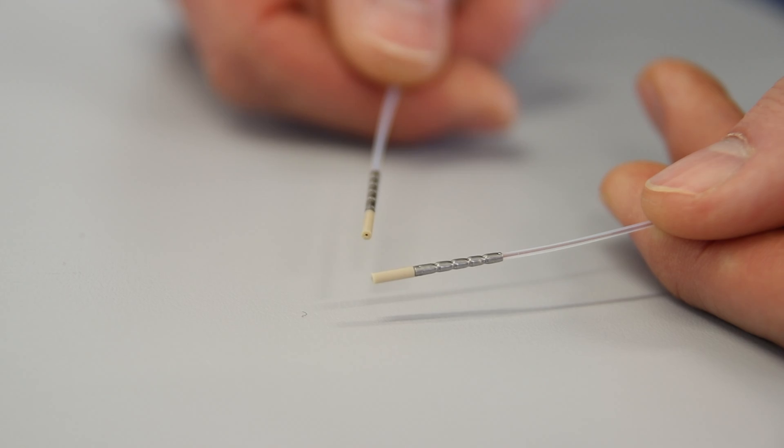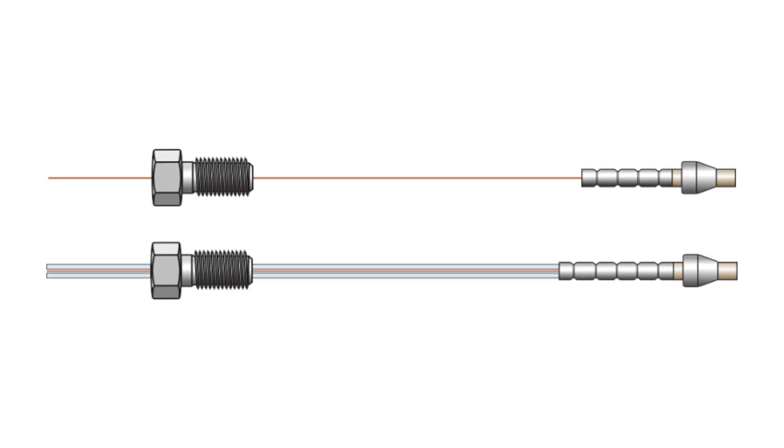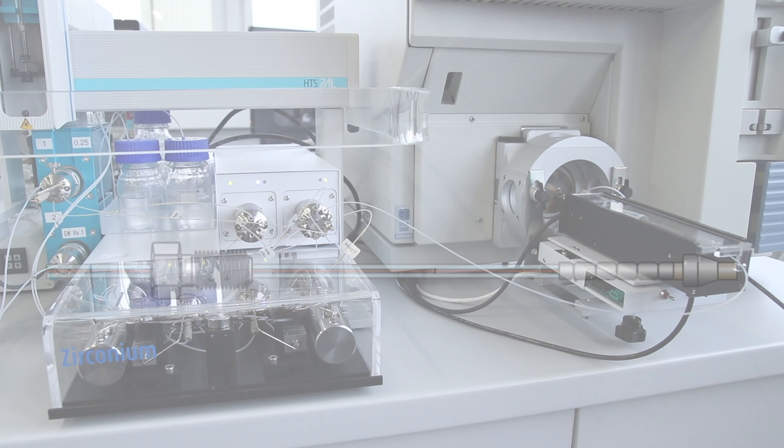In this video, we will demonstrate how to produce a capillary connection with ZercoFit fittings and the PTFE protective tubing. The PTFE tubing is recommended but optional.